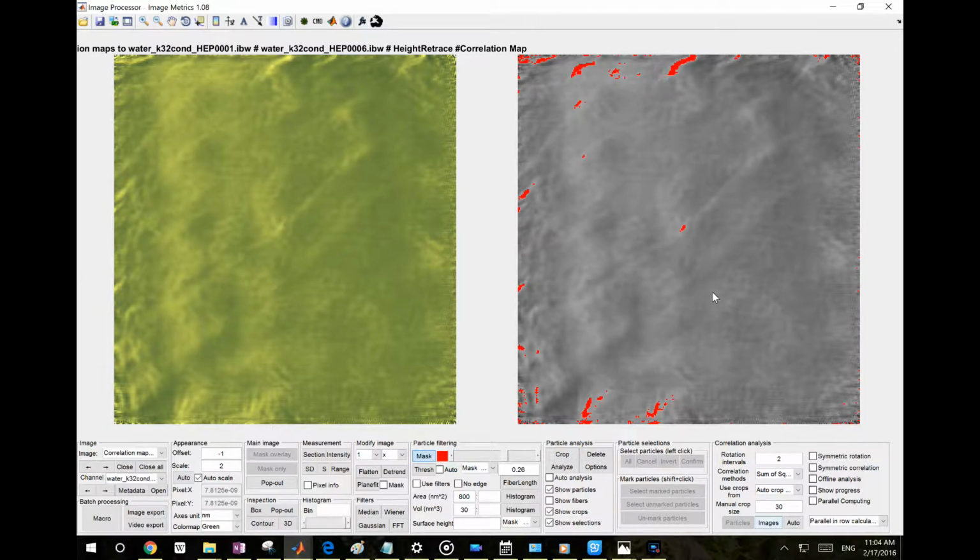Remember that although there are spots elsewhere, they're not really counted into this algorithm. There's a cutoff region, so you don't have to worry about them. All this I'm trying to show you is that the algorithm correctly identifies the peak of the match, and you see the spot moves as the image is drifting, so it finds the correct match.